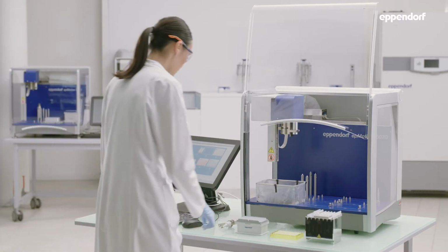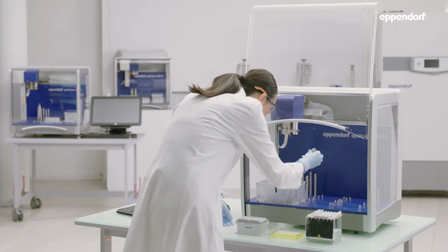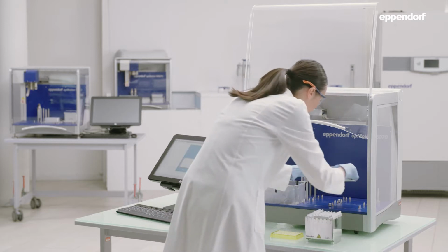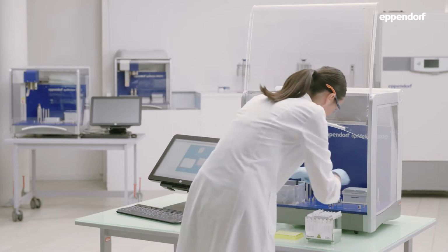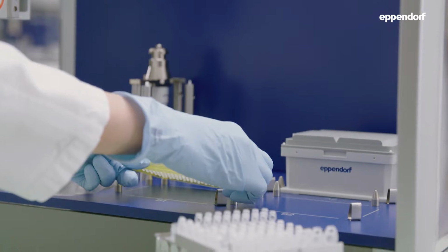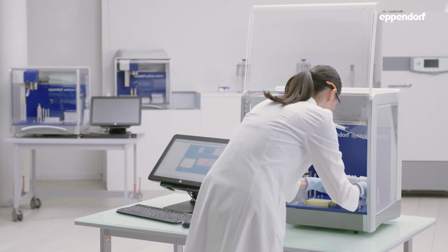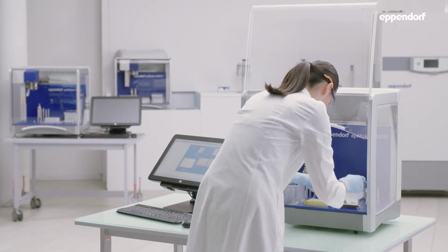In this tutorial, a single-channel pipetting tool with a volume range of 1 to 50 microliters is used. It is placed on the deck. The tips that correspond with the pipetting tool being used, a 96-well PCR plate, reservoir rack for your PCR master mix, and finally your samples and controls are also positioned on the deck.